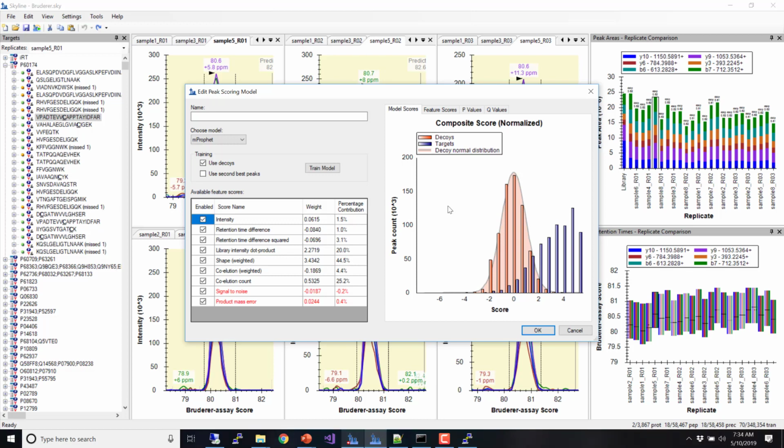Like, what can you do on this graph? Yeah, you can copy it. So right click, it will give you some idea of what you can do from it. So yeah, you can copy a metafile. Copy metafile is really nice for pasting into PowerPoint and Word for posters and things, because you get vector graphics.